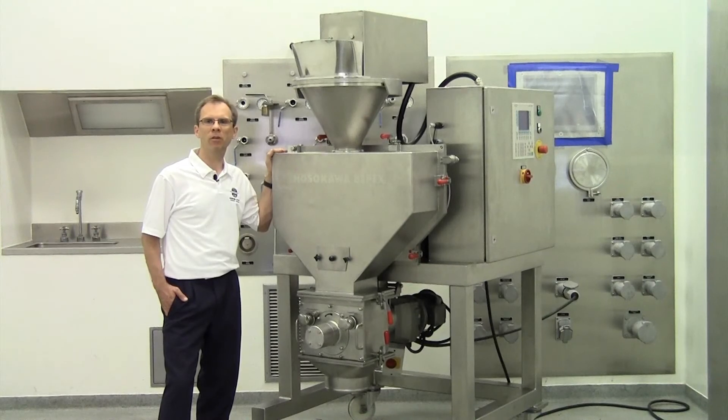Hi, my name is Leroy Heinrichsmeier and I'm specialized in compaction technology for Hosokawa Micron Powder Systems based in Summit, New Jersey. In the next few minutes I will give you a quick introduction to the Hosokawa Alpine Pharma Pactor.